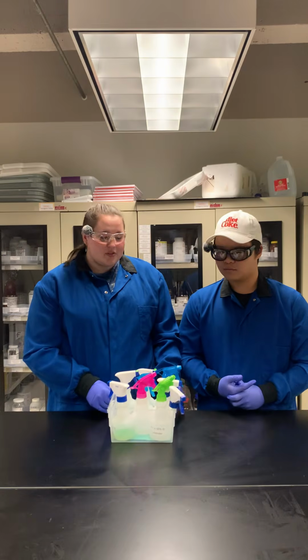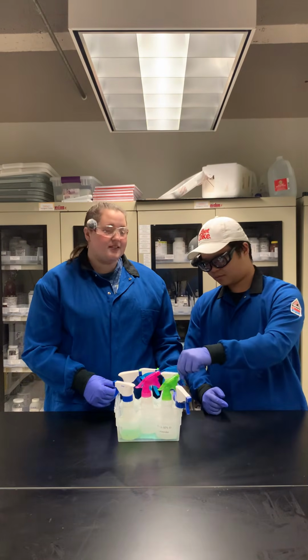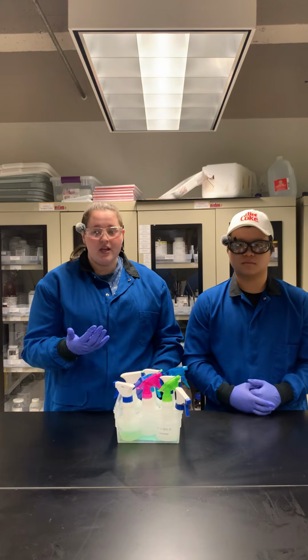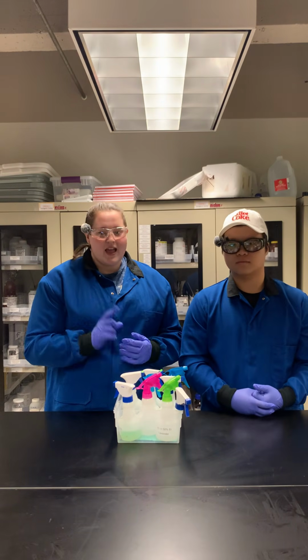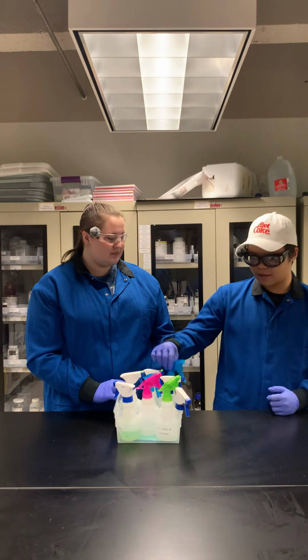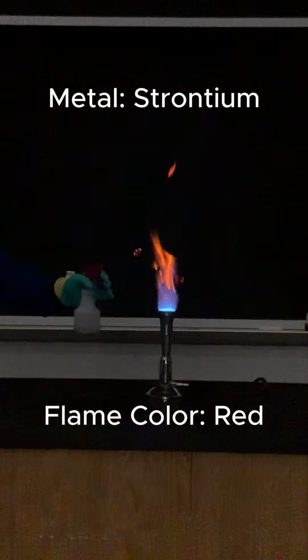Well, I have several solutions here filled with metal ions, since metals have a lot of electrons. When we spray them over a Bunsen burner, this will excite the electrons, and we might be able to see them release their photons to get back to ground state. Oh, that's awesome. Let's try it.